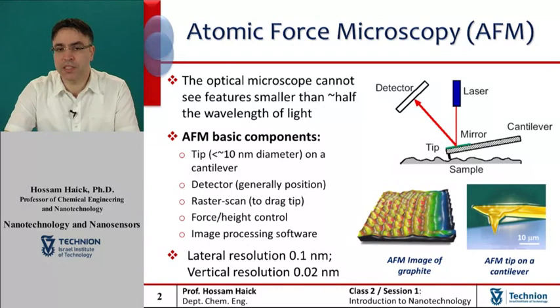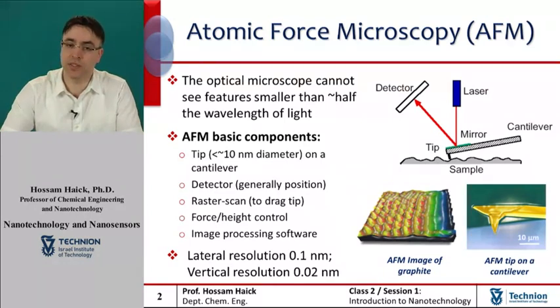Usually, the sample is mounted on a piezoelectric tube that can move the sample in the Z direction for maintaining a constant force. On the other hand, the X and the Y directions are used for scanning the sample. In alternative modes, a tripod configuration of three piezoelectric crystals may be employed, with each responsible for scanning in the X, Y, and the Z directions.